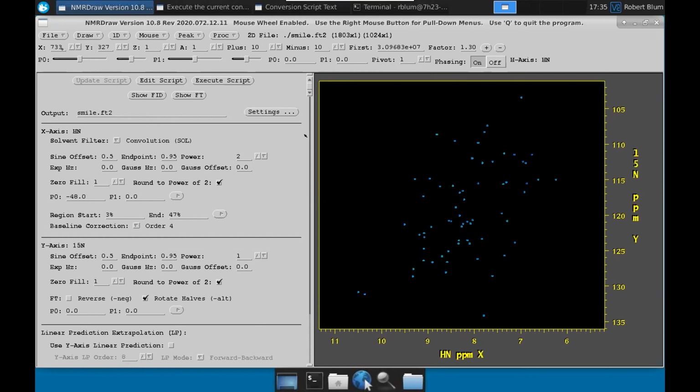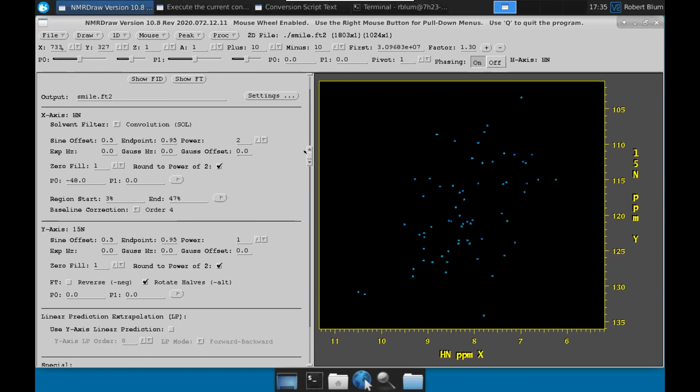So congratulations. Yeah, and then similarly for the NUS data, I would follow a similar workflow to the one that you showed just before this, right? Yeah, that's exactly right. Great. Makes me feel a lot more confident in using this.